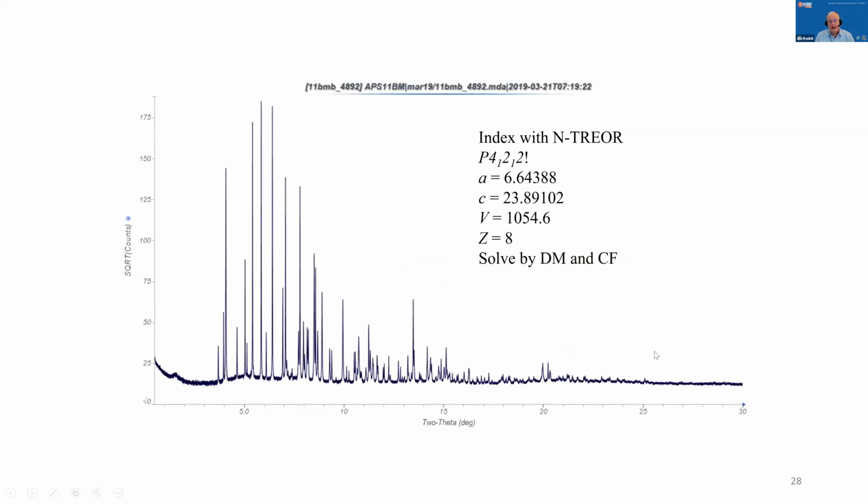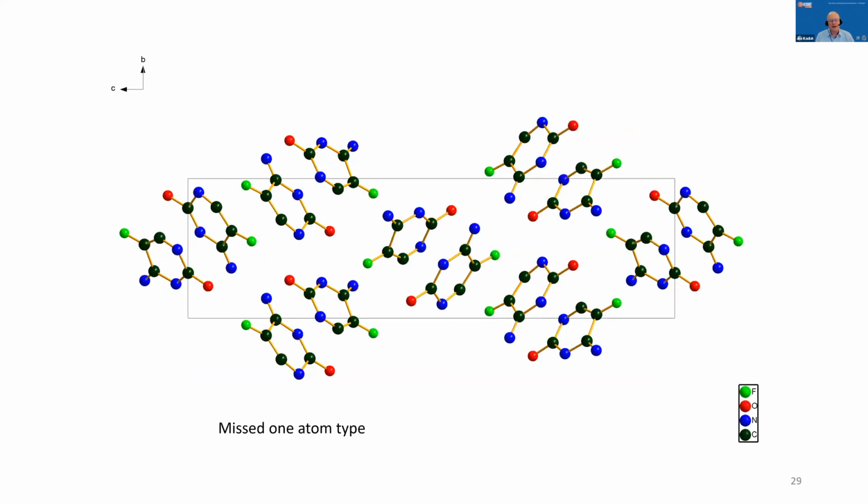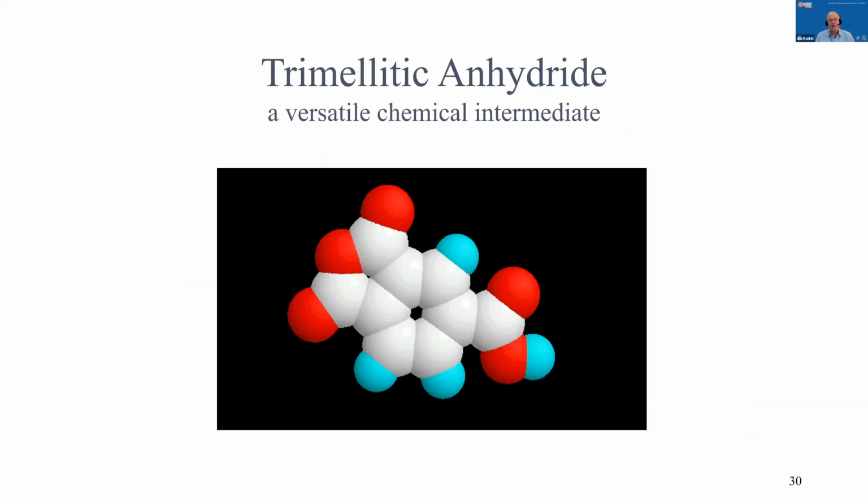And the key was we have good, accurate intensities out in this range. When the pattern dies by 20 degrees at the synchrotron wavelength, you know you're not going to have much success. Direct methods and charge flipping from synchrotron data like this on an organic material work 15 or 20% of the time. So most of the structures I solve are from Monte Carlo simulated annealing, which we'll talk about next. Not quite next. We've got a real space example.